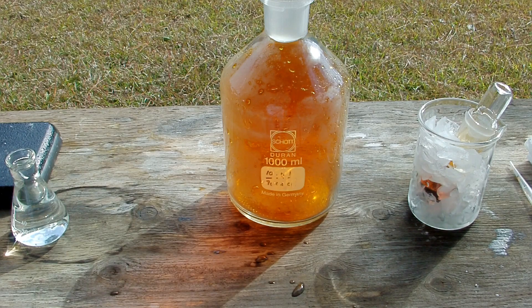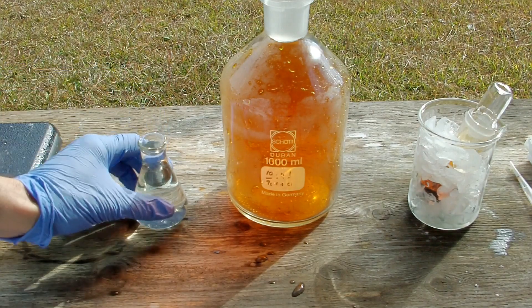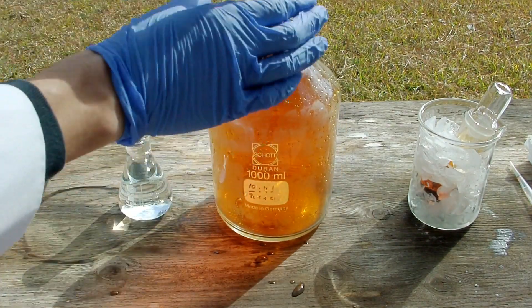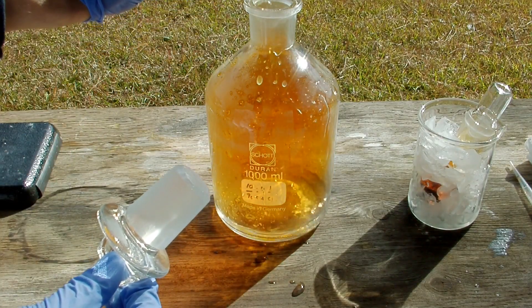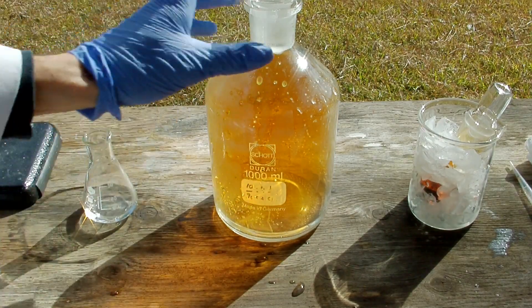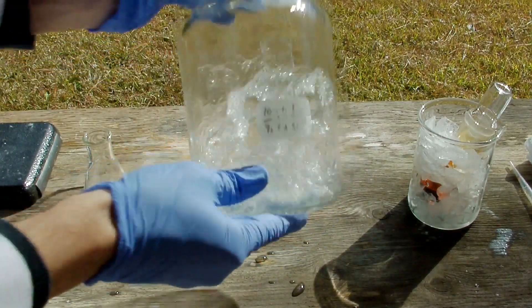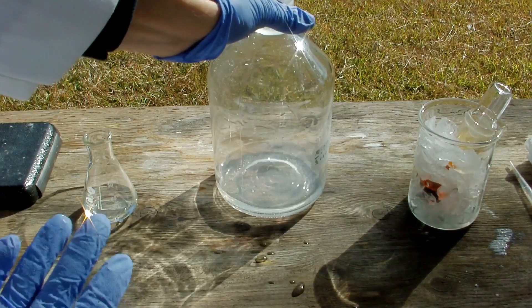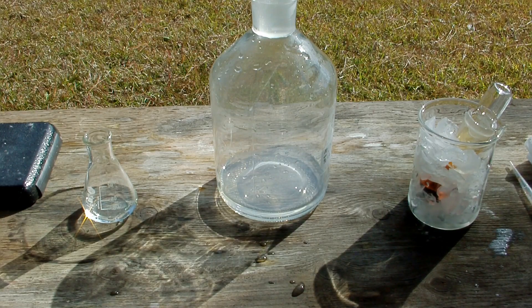The name bromine actually comes from the Greek word for stench. So I'm going to dispose of all the rest of this using sodium thiosulfate solution — I've got a one molar solution here. Let's see if that can get rid of the vapor. Look at that — it completely clears it up. What that did is reduce the bromine back to harmless bromide, which fell back into solution. So that's what I'm going to do for all the liter of liquid I have left over, to destroy the residual bromine water.